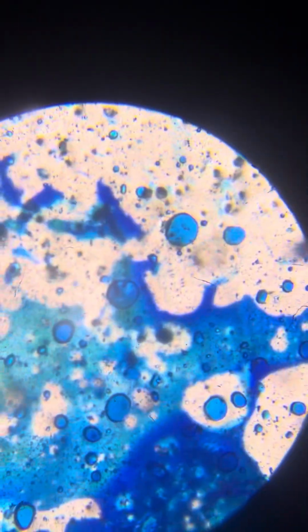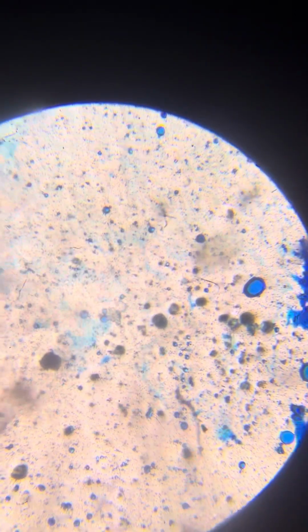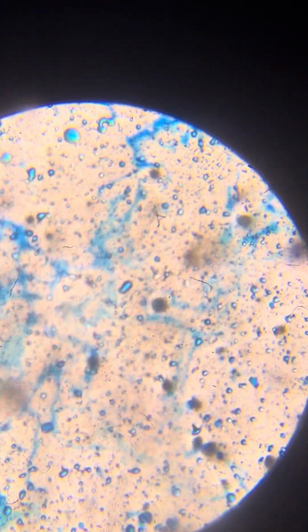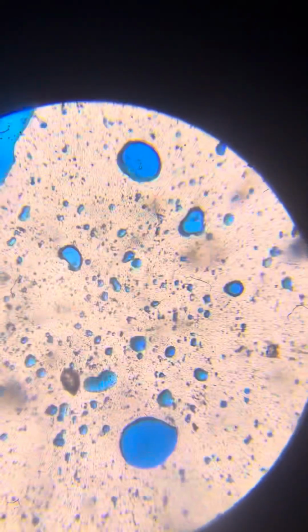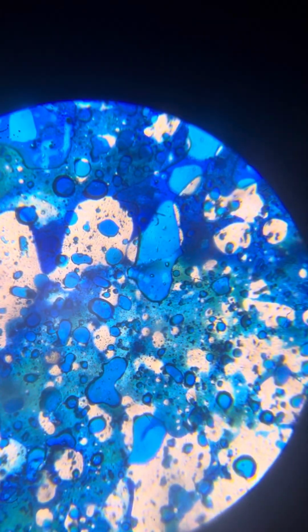So many. Yes, we now know, even though we already assumed it, that you can put neros in a sealed container inside oil for more than a year, and they will survive very, very well. Extremely well. We already saw this after a month or so, 45 days, so we had this notion since April or May or June last year.